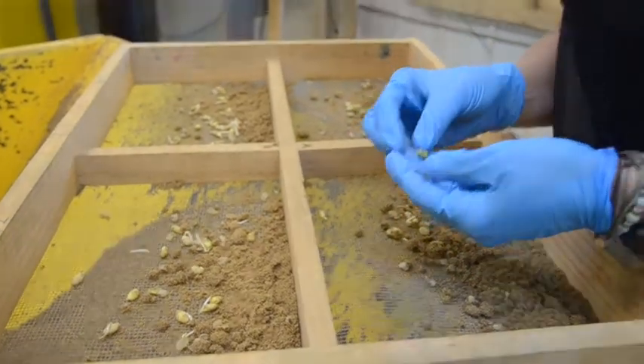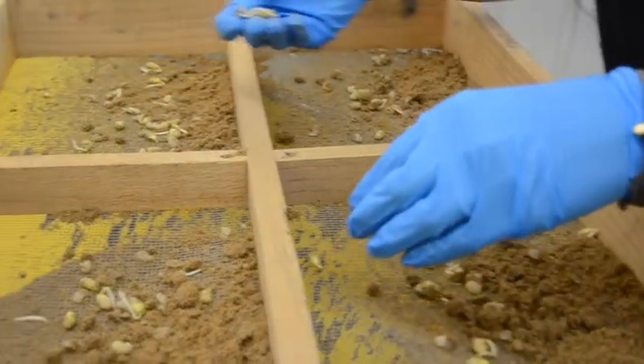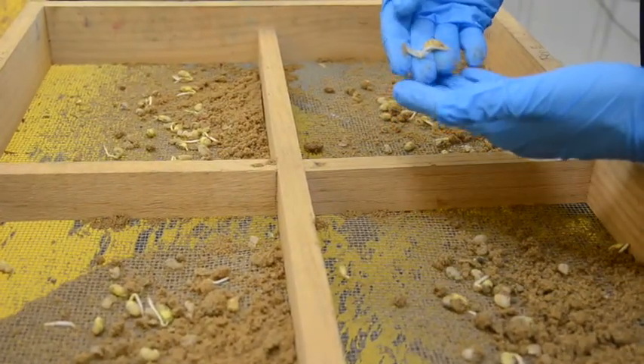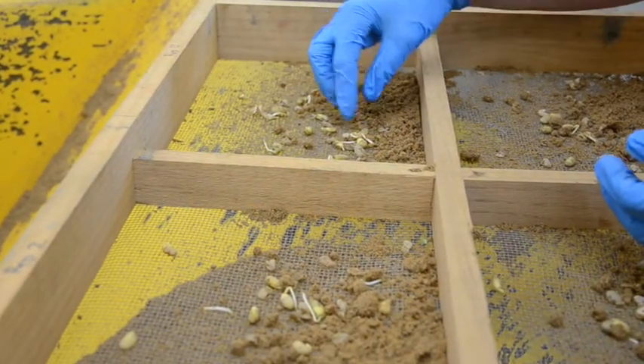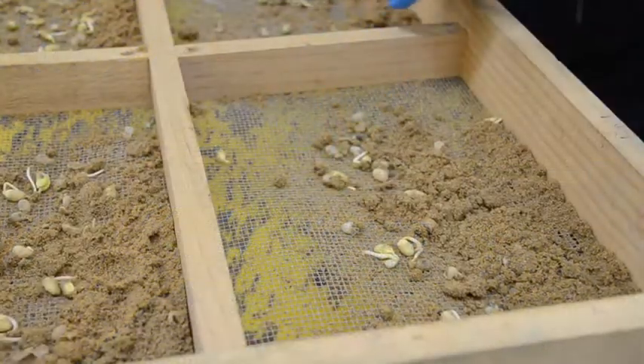Normal seedlings need to have healthy cotyledon tissue and sufficient roots to anchor into the system — into the crepe cellulose paper and sand — and a healthy hypocotyl.